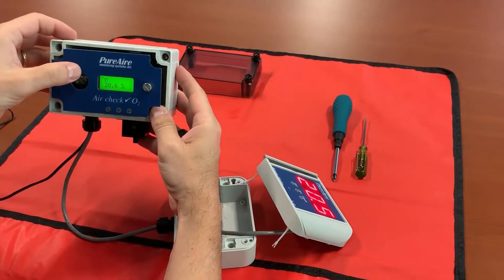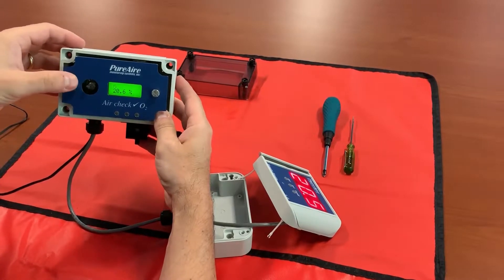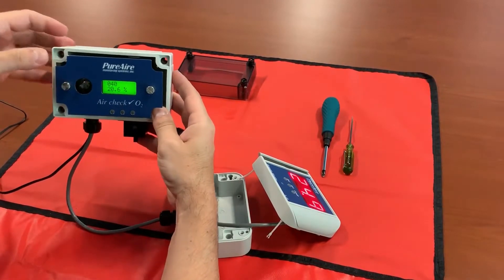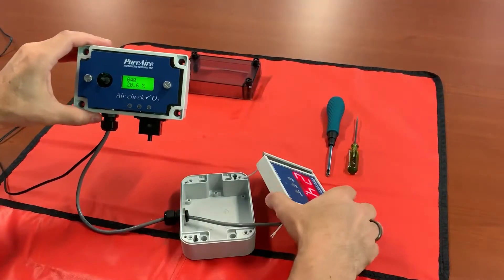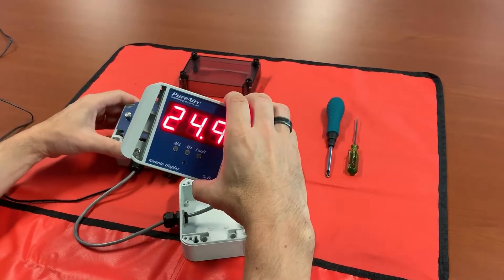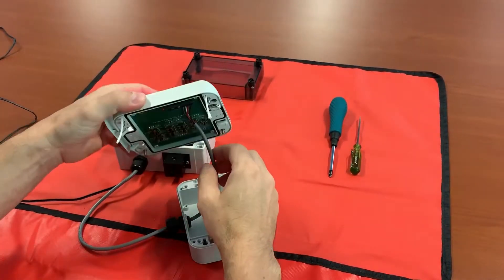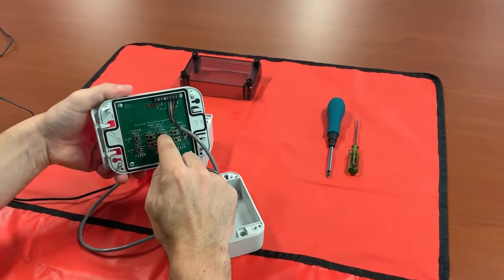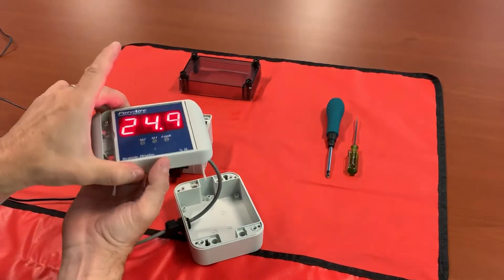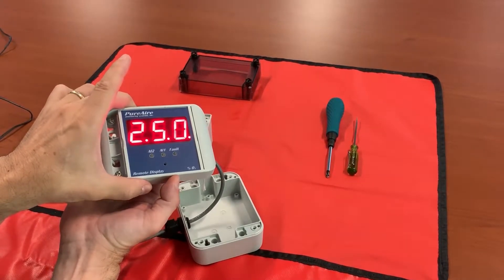Now go to the left once to exit, go down, and now you're in your set 20 milliamp span menu. Go to the right — at this point we're outputting a 20 milliamp signal, which should be 25 on your remote display. As you can see it's reading 24.9. Do the same thing we did with the zero, only with the span this time — push and hold your span button and you get 25.